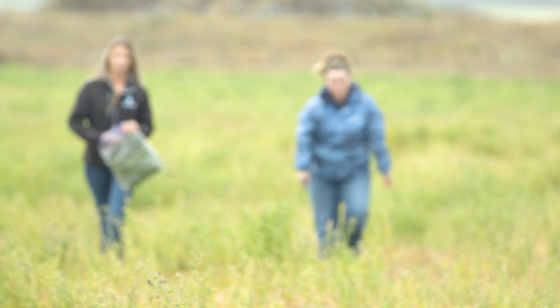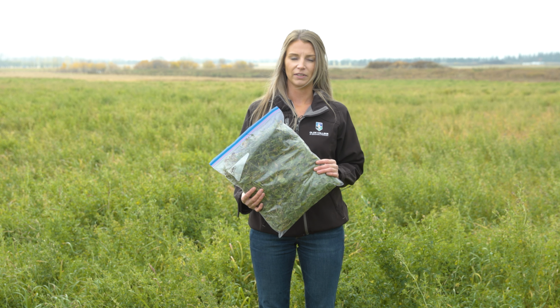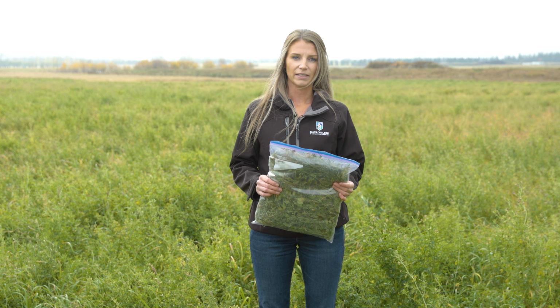Now that we have collected our full bag of forage samples, we can proceed to take the nitrate rapid in-field test. With that test, we will look at how to interpret the results as well as next steps on how to manage your forages.